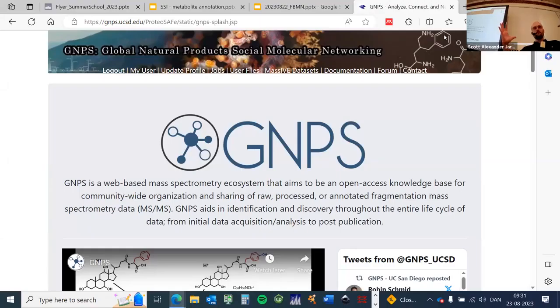The structure of this will be, Daniel will walk us through the theory. Robin already walked us through a little bit yesterday. He's going to walk us through more theory of molecular networking. But first, we're going to set up the workflow and get that running so that by 2/3 of the way through the session, our data files will all be finished, and then we can look at the data together.